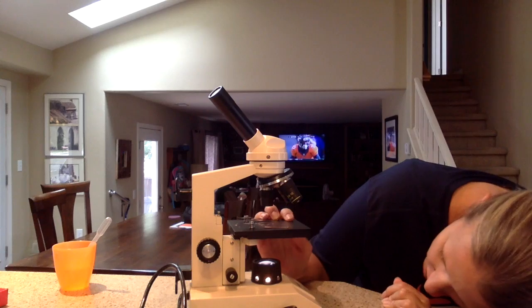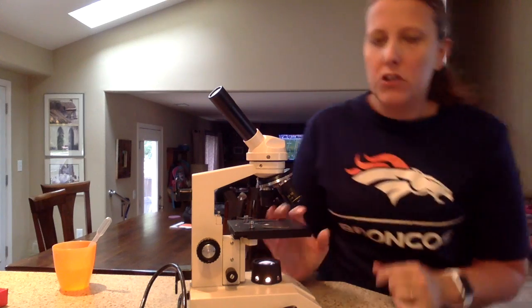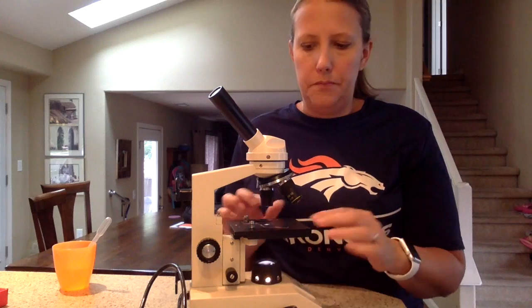Depending on the microscope, they adjust differently, but you just want to make sure the most possible light is coming through the stage.